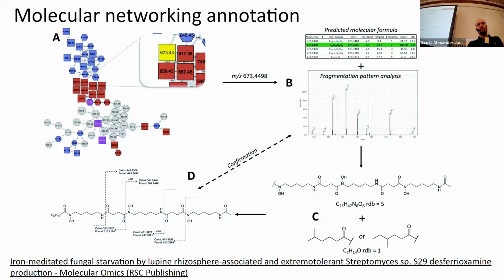Again, you have to be careful what type of compounds you're annotating. For a lot of the drug-like compounds that we might observe in the data today, there are only very few potential positions where modifications like oxidation can happen. So it's also highly possible that the smaller your structure gets, the easier your annotations could become. But this is not a general rule. It depends on the complexity of the structure.